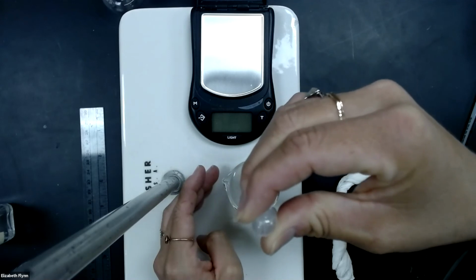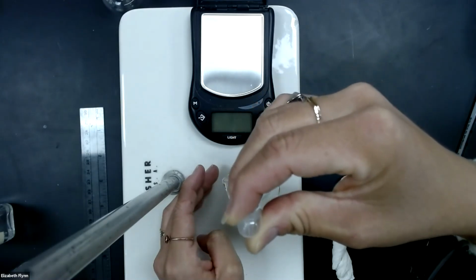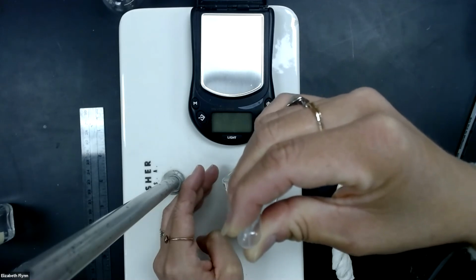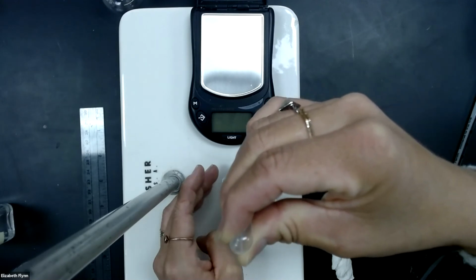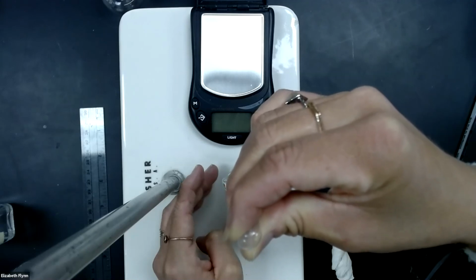Make sure you just count. It doesn't have to be exactly 30 as long as you know how many. 2, 3, 4, 5, 6, 7, 8, 9, 10, 11, 12, 13, 14, 15, 16, 17, 18, 19, 20, 21, 22, 23, 24, 25, 26, 27, 28, 29, 30.